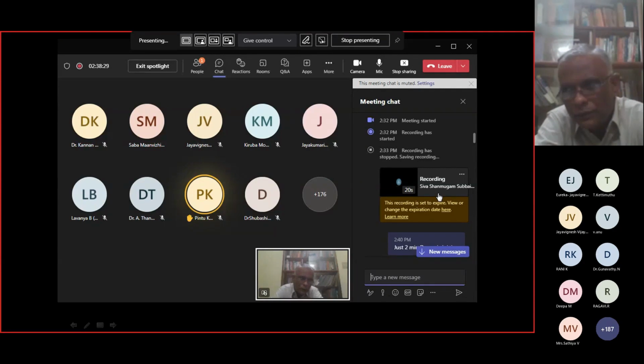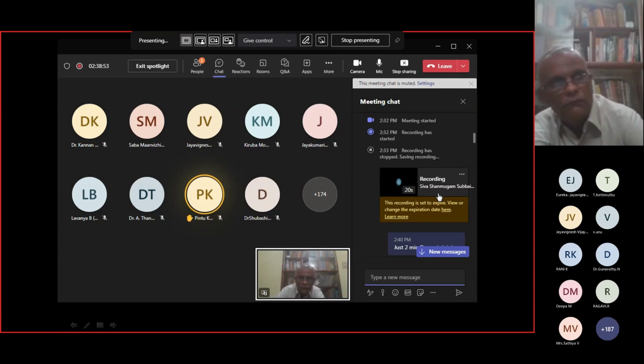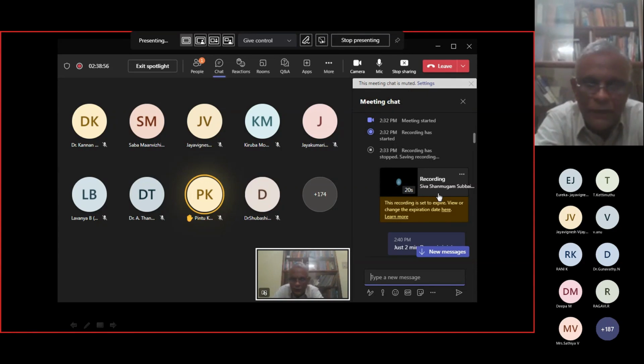I can cite one example. When I was working for a company known as UB, United Breweries Pharma Division, we were making ranitidine. In ranitidine, one impurity, one related substance, should not be there beyond a level of 0.05%. In HPLC, it was not found, whereas in TLC we could find it, and we proved that one well-known company in India, which was making it at that time, had the impurity beyond 0.05%. We made them understand, and it helped me get an entry into that company as head of the QC department.